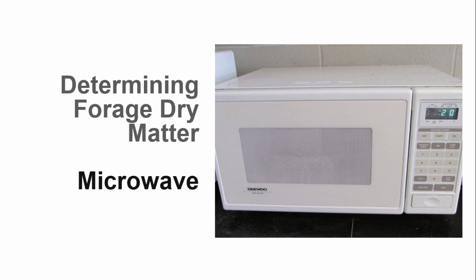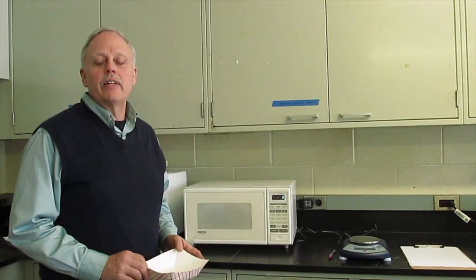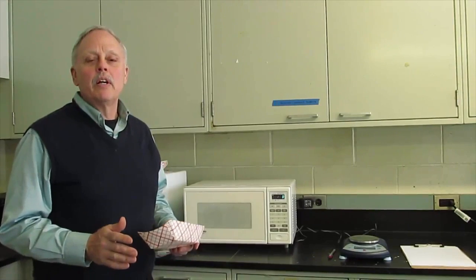We will demonstrate two methods, beginning with the microwave. The microwave is used to dry a sample, and the moisture content is calculated using the change in the sample weight before and after drying. Dr. Judd Heinrichs will walk you through the steps. Using a microwave for forage dry matter testing is a relatively simple thing to do on the farm and gives you a good, accurate value for dry matter.